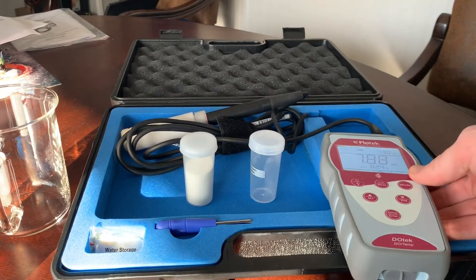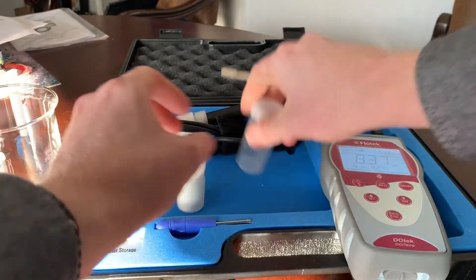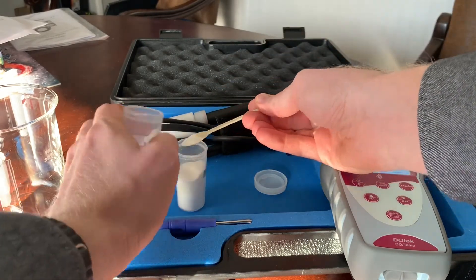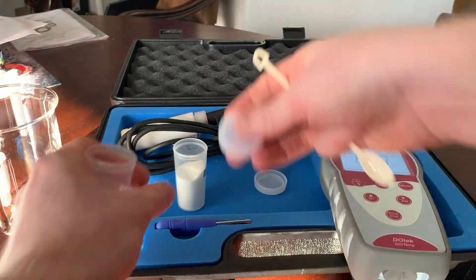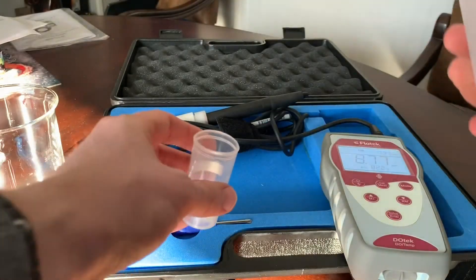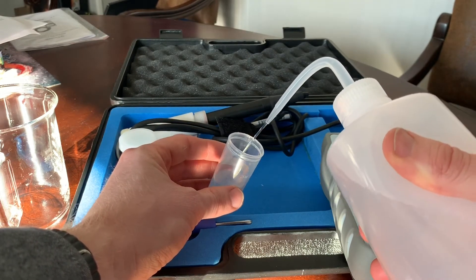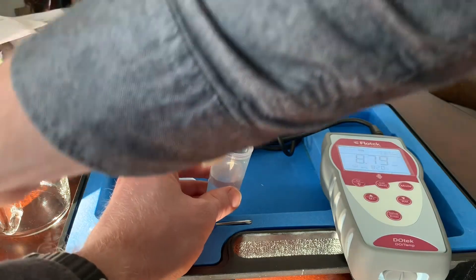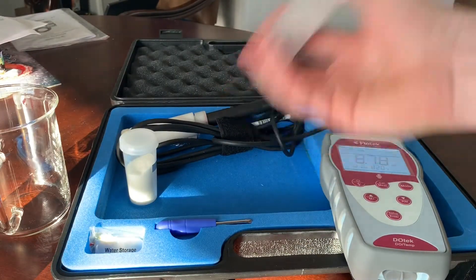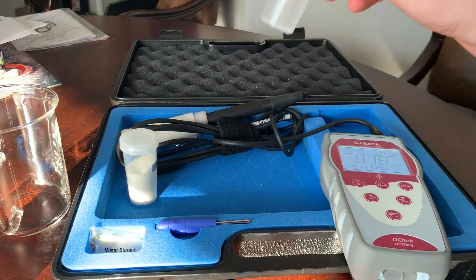The first thing we want to do is make a zero solution. We're going to take a little bit of our sodium sulfite — about half a gram or one little spoonful. This solution takes a little bit of time to deplete all the oxygen, so I suggest doing this first. Take some room temperature DI water, put about 20 milliliters in with that half gram, shake it up, and let it sit for about 10 to 20 minutes to let the oxygen get consumed by the sodium sulfite.